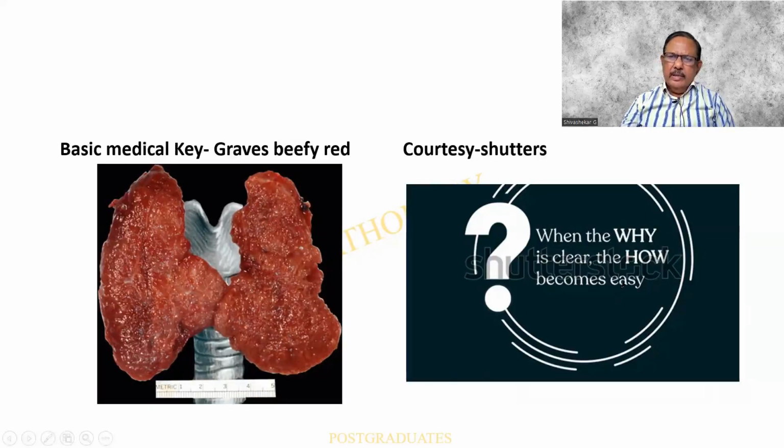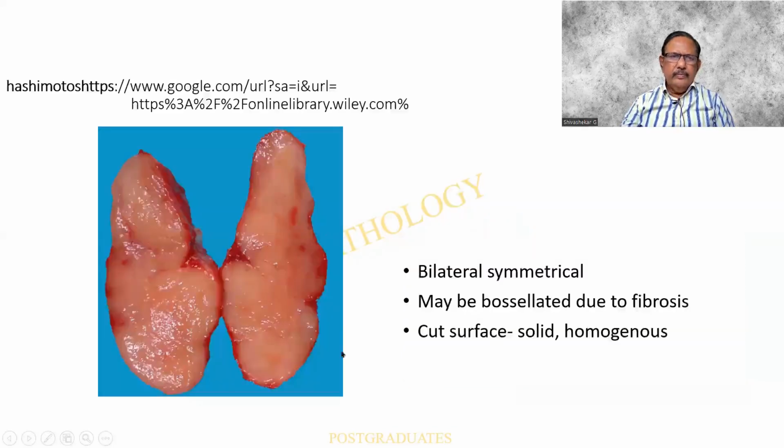When the why is clear, the how becomes easy. Courtesy Shutterstock. And look at the contrast over here. Here again, there is a symmetry. It is solid and not much honeycombing is made out. No areas of hemorrhage or necrosis.